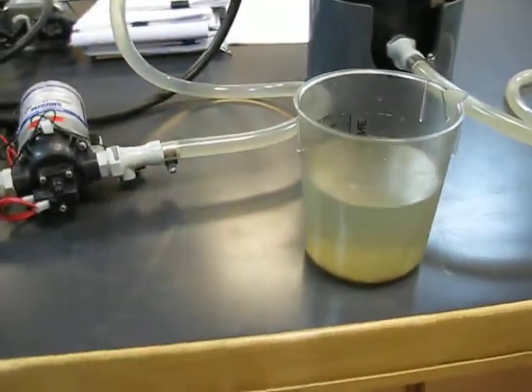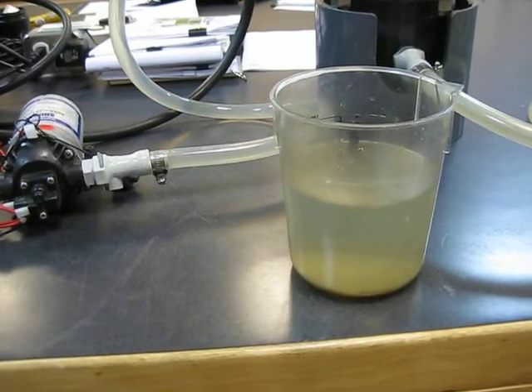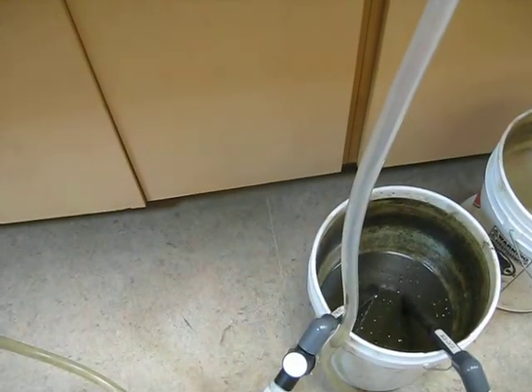And this is a picture of the fluid here now. So it's quite contaminated fluid. Emulsion there, some oil in there, and some solids, and general suspended solids. And there's our source bucket right here.